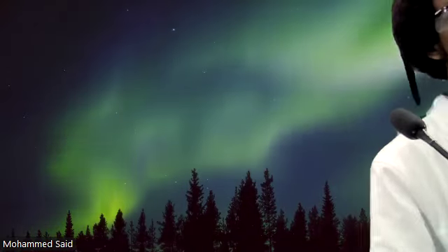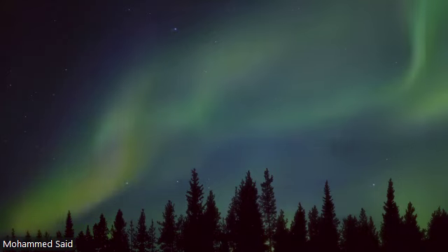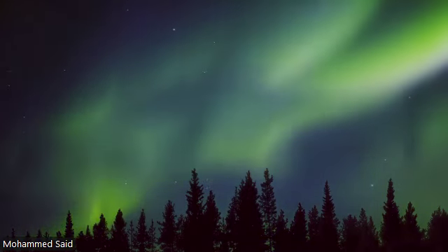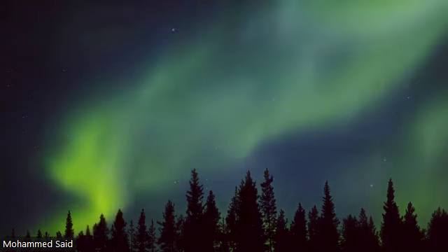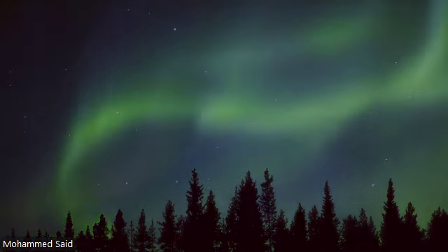Okay. So essentially, we'll get ready in a minute or so. I'm gonna start prepping up the microplate reader because I have to do these incubations. But if anyone has a timer that I could use, if you're comfortable, because I'm dealing with two different groups at the same time, so it's a bit difficult.